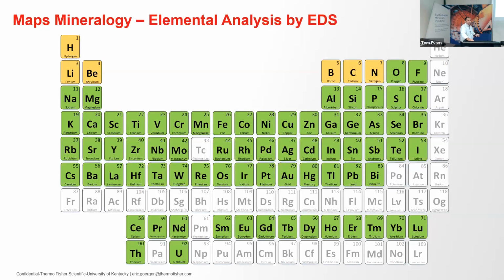The ones that are in yellow are inferred. Basically, what we do, the software will do a spectrum matching first. For example, if we have spodumene, the software can use the whole spectrum of spodumene as a fingerprint of the mineral to identify the mineral first. And then we know spodumene could contain 3 or 3.5% of lithium. And then the software will renormalize all the quantified results with the ones that are inferred, basically after identifying the mineral, which are the ones in yellow.